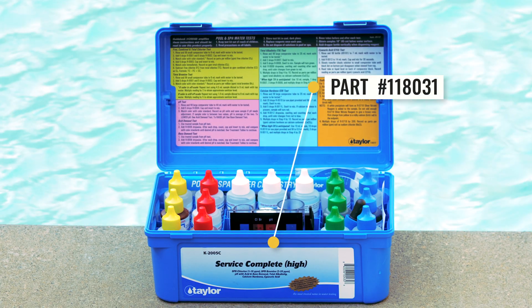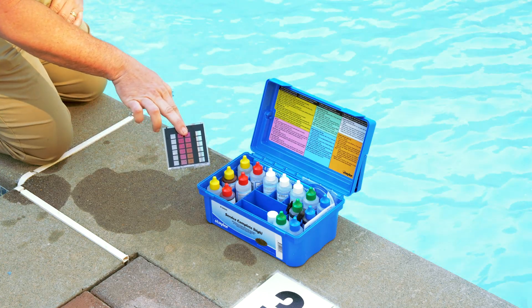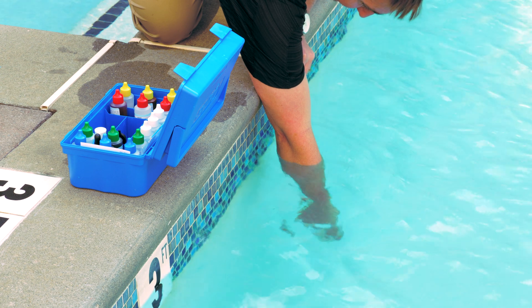First, to test the CYA, collect a water sample. Hold your container upside down so the opening is facing the pool. Then lower the container into the water 18 inches, roughly up to your elbow.